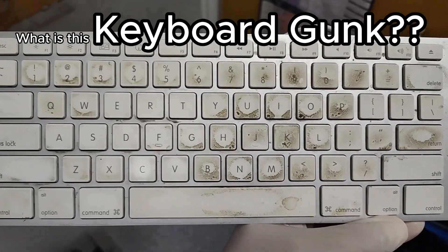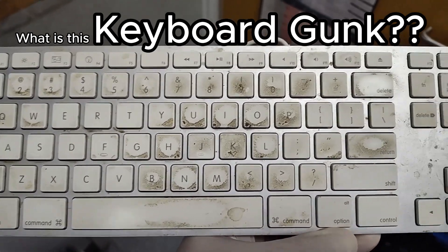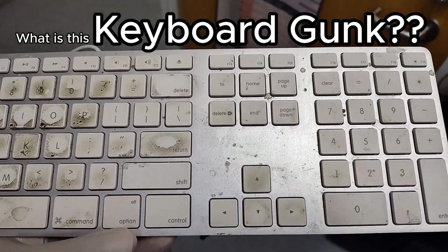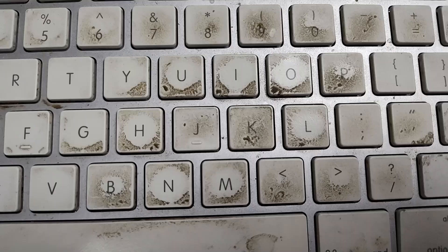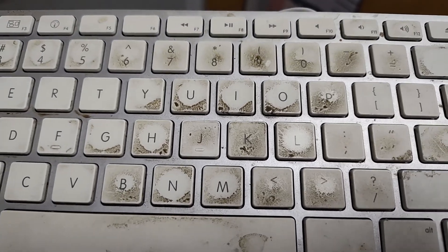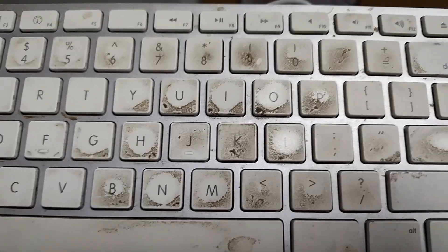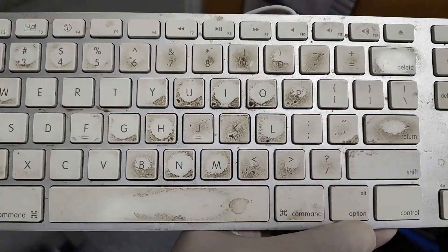I'm sure somebody out there has got a dirty keyboard that looks just like this. This was a really nice matte keyboard, but then your fingers — humans are gross over time — and they always kind of look like this. What is this stuff? Let's see if we can figure that out.